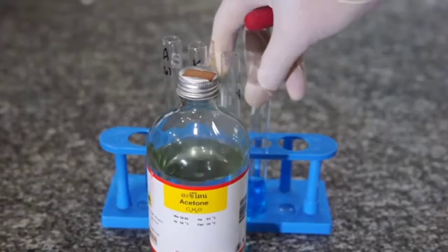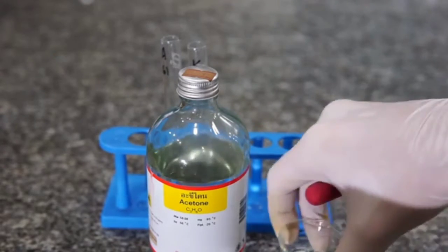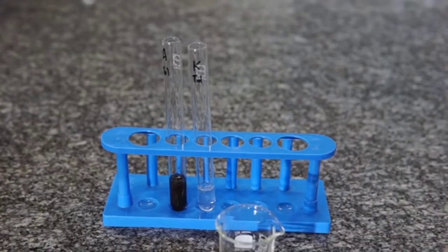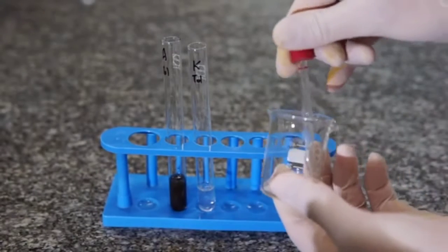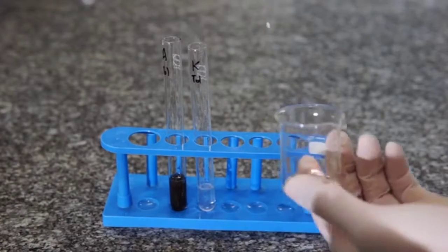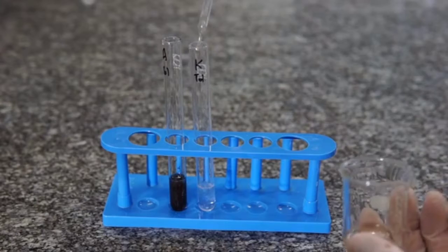So that's the aldehyde. Next up, we've got the acetone. Remember, that's also called propanone. Add that to the Tollens reagent, and you can see there's no obvious reaction happening, even if we add a little bit more.